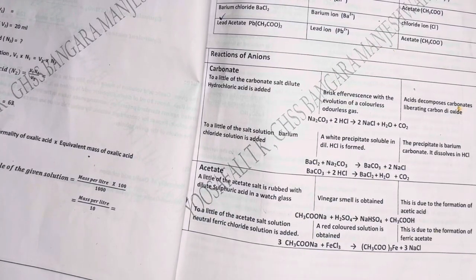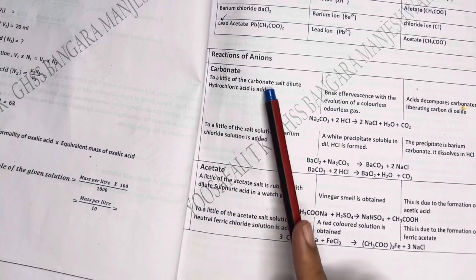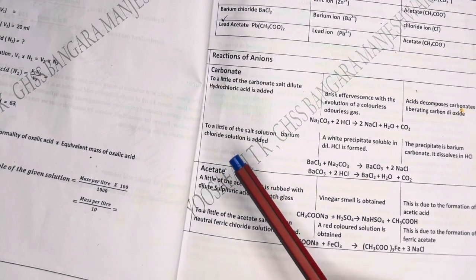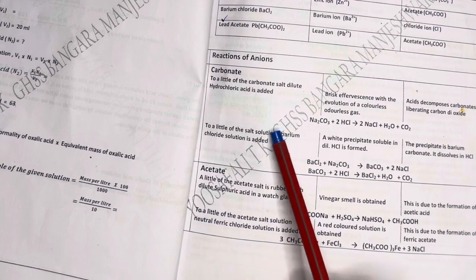So in today's class, we'll be looking at the confirmatory tests for the different anions present. If the anion is carbonate, then we'll move on to the confirmatory test for carbonate. In order to do that, to a little of the carbonate salt, dilute hydrochloric acid is added. So you have to take a little of the salt, that is, carbonate is present, right? So dilute hydrochloric acid is added.